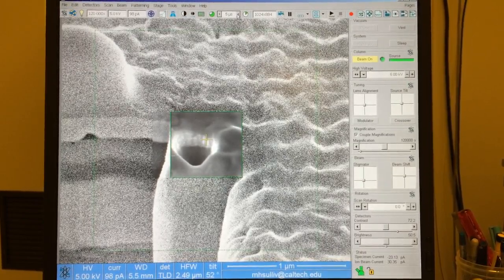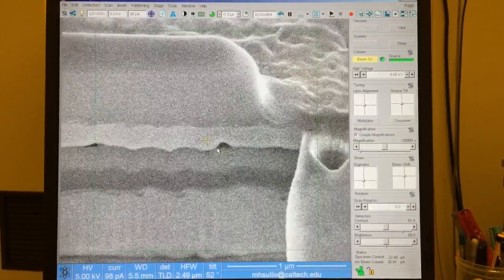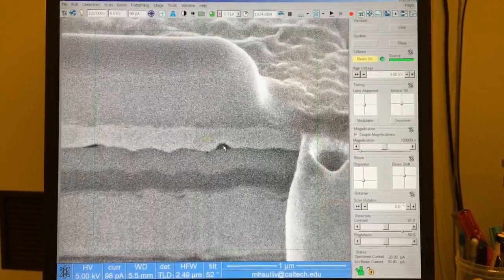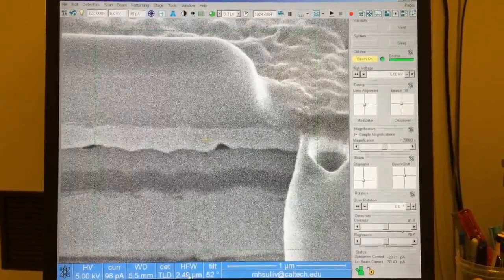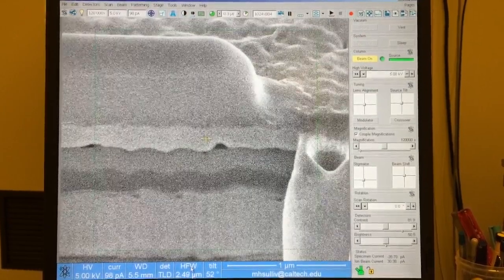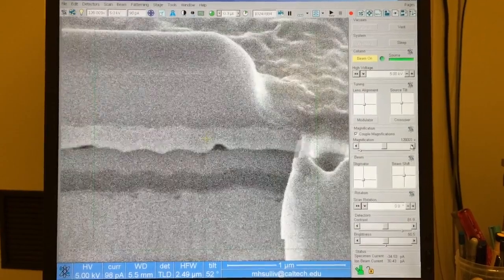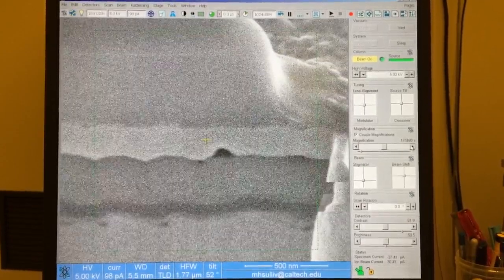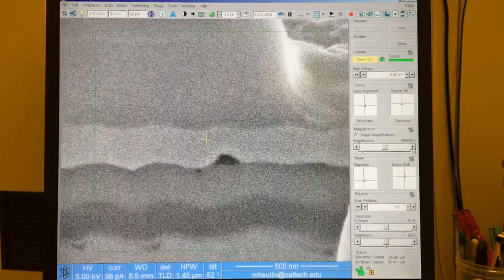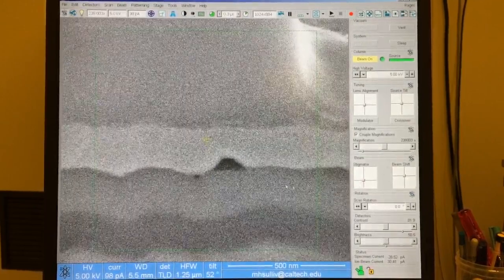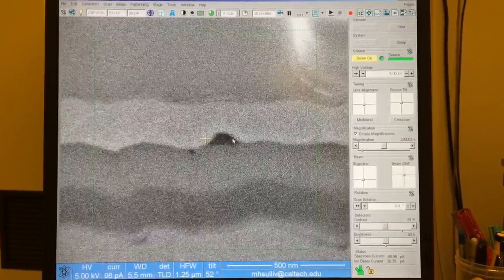So, how to do that: let's go back to our 5 microseconds, and I'm going to click out of the reduced window and go over to my cross-section surface. I think we're going to use this feature here that'll give us a nice chance to see some rounded and sharp edges for our alignment. I want to make sure I'm at a reasonable magnification — or as I'd like to refer to it, the horizontal field width as expressed in units of length. In this ultra-high resolution immersion mode, we'll get our best alignment somewhere between an HFW of about 1 and 1.5 microns, so I'll go to about 1.25. I'm going to be using shift-left-click as beam shift to reposition my image rather than double-clicking to move the stage.